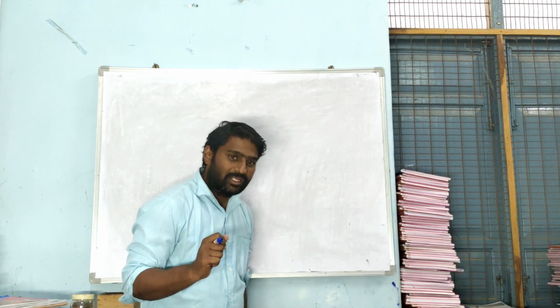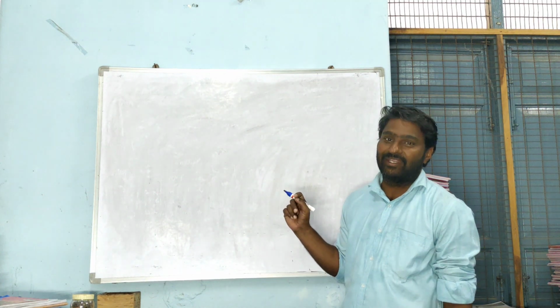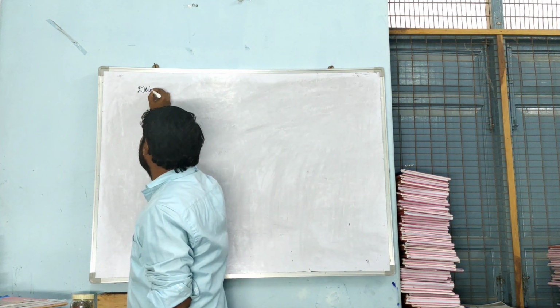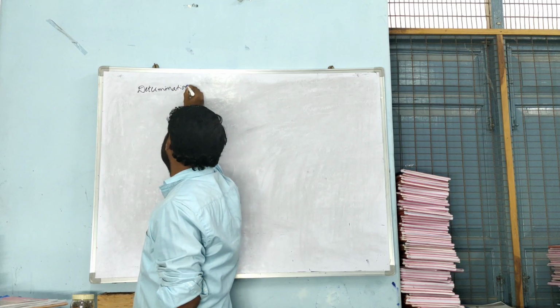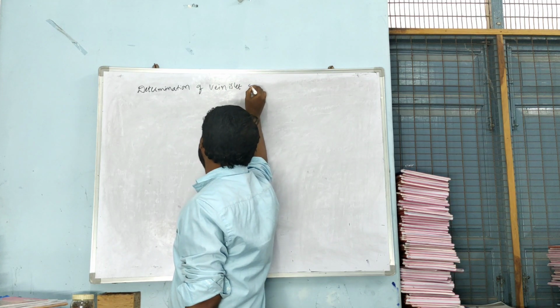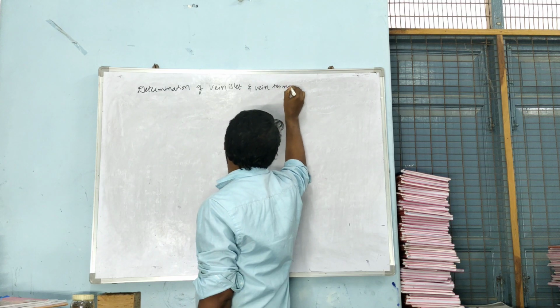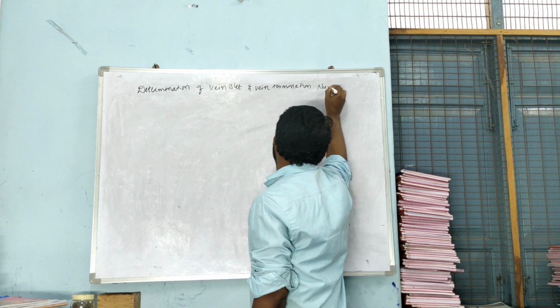Right? So today we are supposed to learn about determination of vein islet and vein termination number. So this will be in the practical included for the pharmacy second year and second sem. It is determination of vein islet and vein termination number.